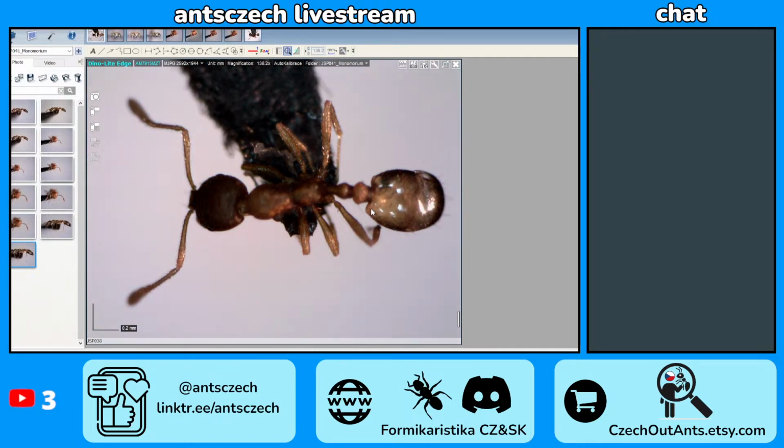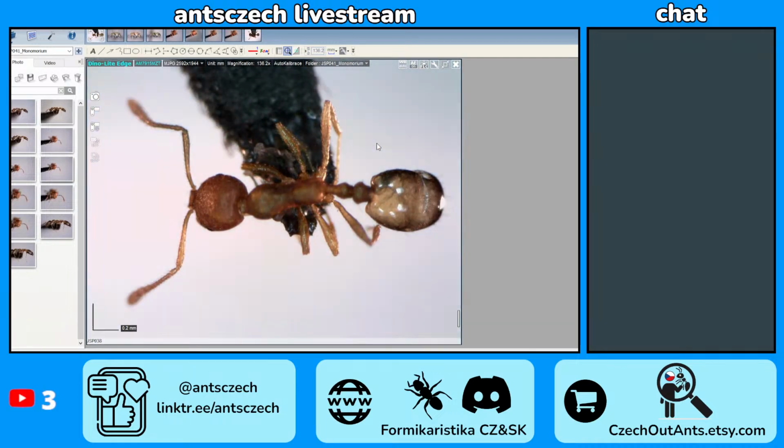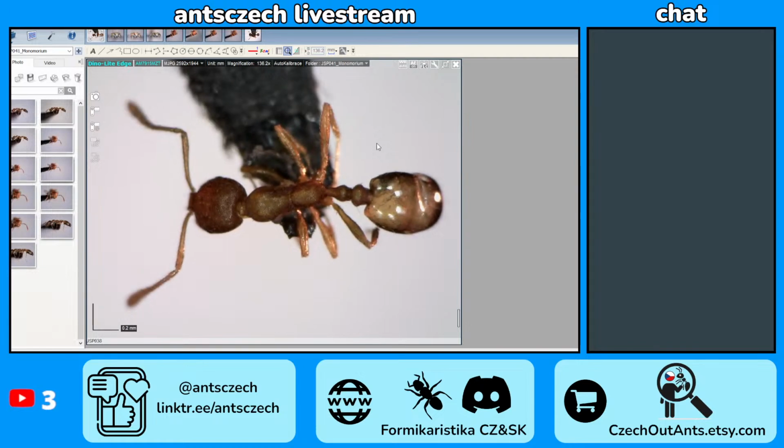How do I position this? I always try to position it at the same angle as the camera or the lens itself, but it's always very hard. It's like impossible here with this setup. I would have to drill holes in the microscope to put it in the same direction. So, it should be more dry. Let's see if it worked.